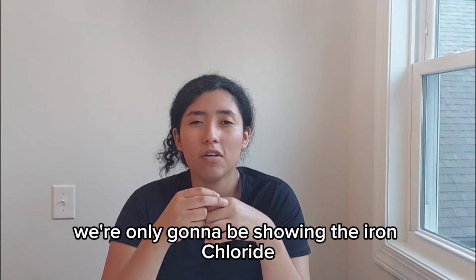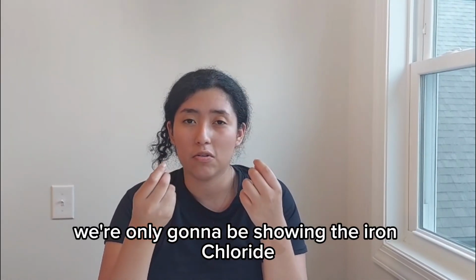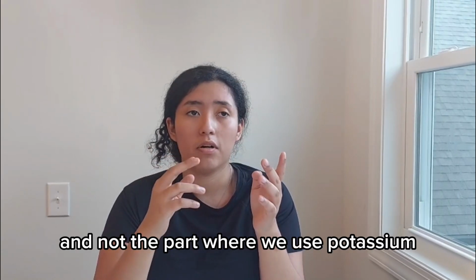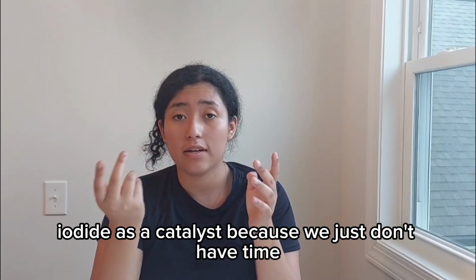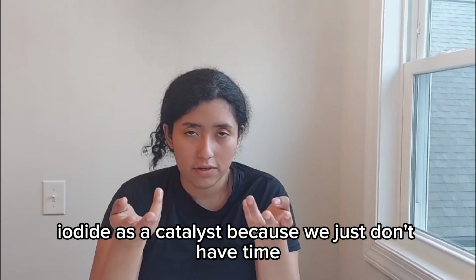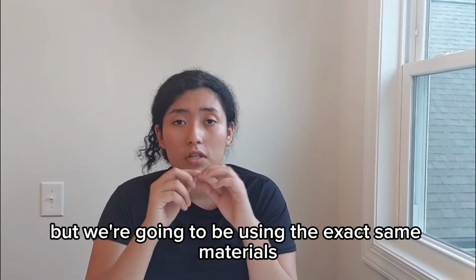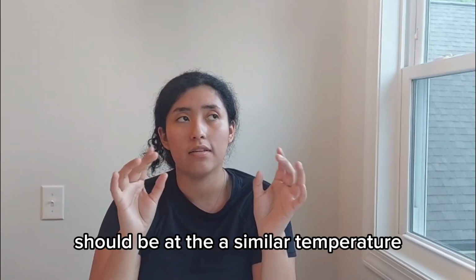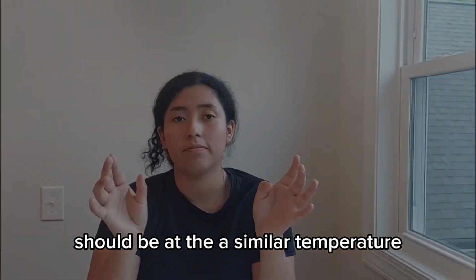In the video, we're only going to be showing the iron trichloride part of the experiment and not the part where we use potassium iodide as a catalyst, because we just don't have time. So we're going to be using the exact same materials, and it should be at a similar temperature.